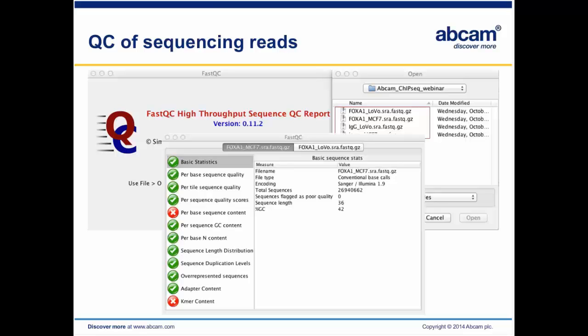It gives you many QC metrics of your sequencing reads. The usage of FastQC is beyond the scope of this webinar, and we won't cover all the metrics in the program. Here, we will only focus on 3 metrics.